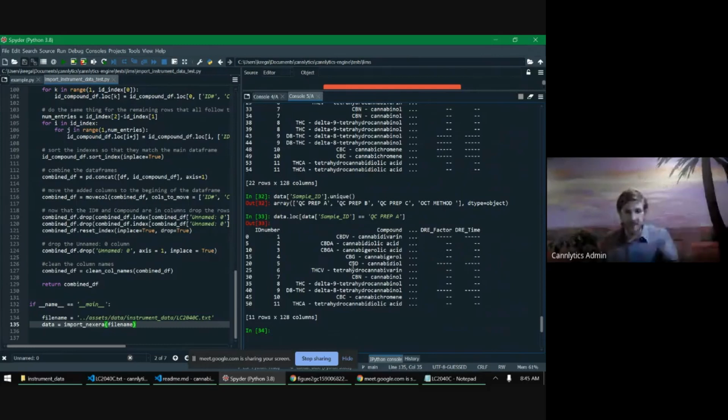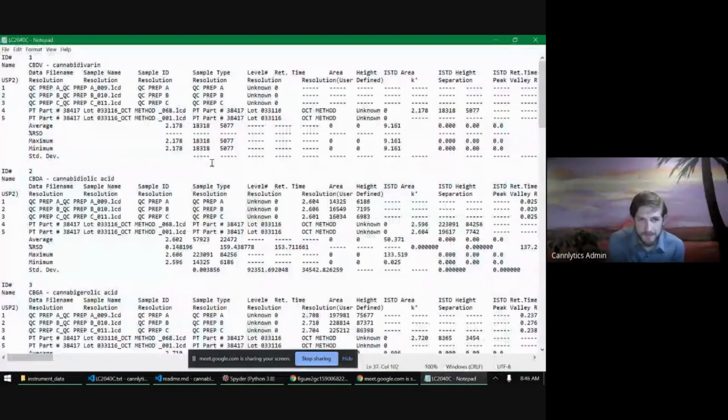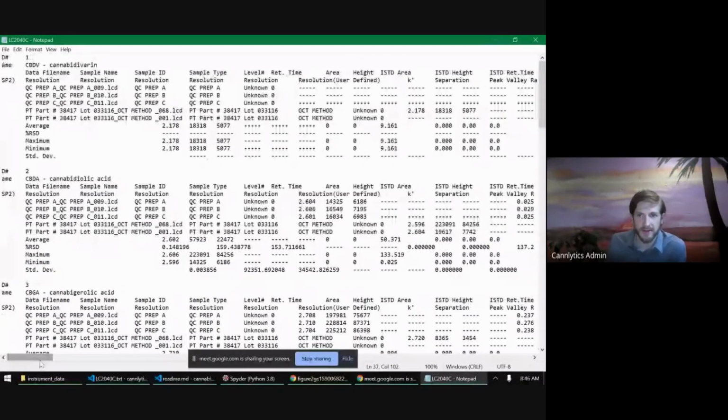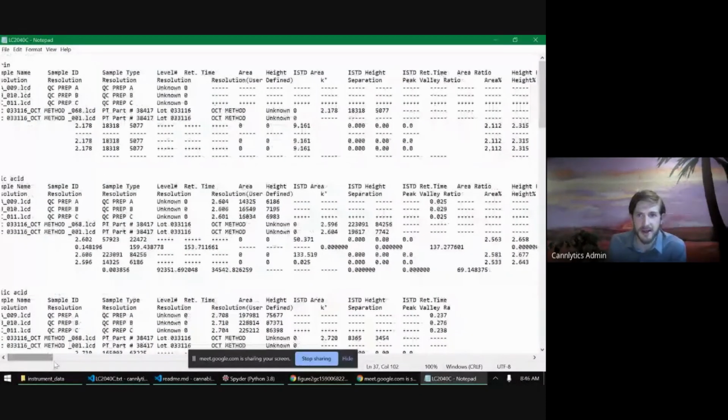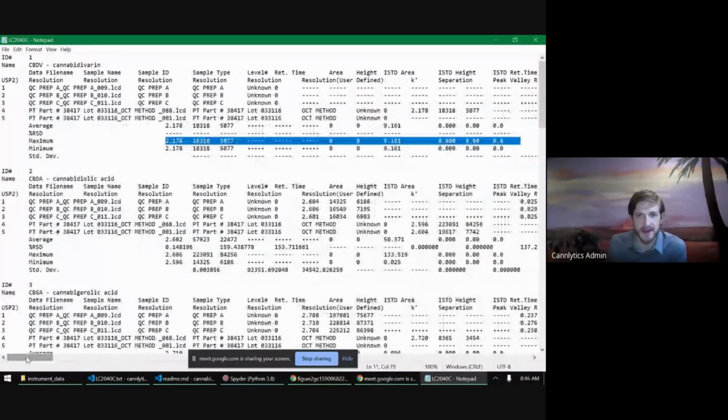And you could take it from there, and so essentially this is a critical step in the data collection process, because I'll just let you know, when I started as a laboratory analyst, essentially until there was a good way to import this data, I was essentially just transcribing all of these concentrations by hand into the database.